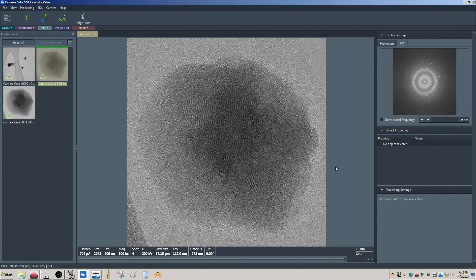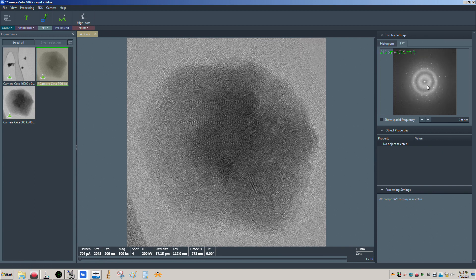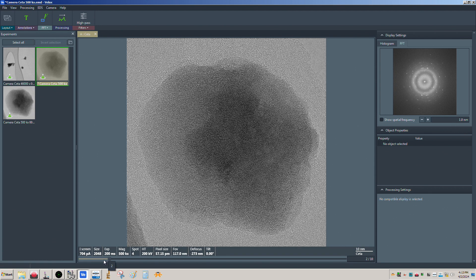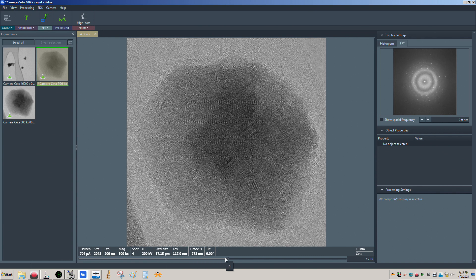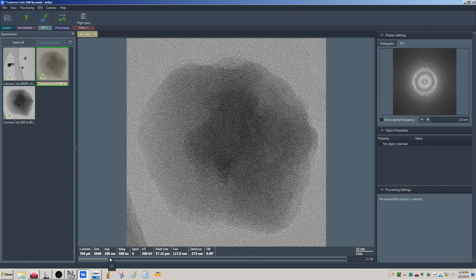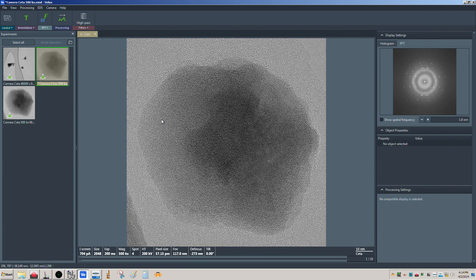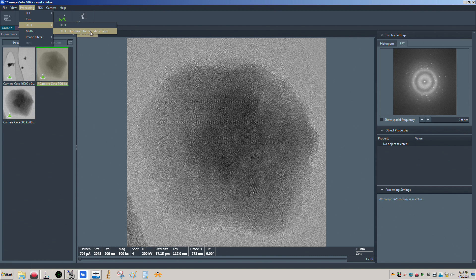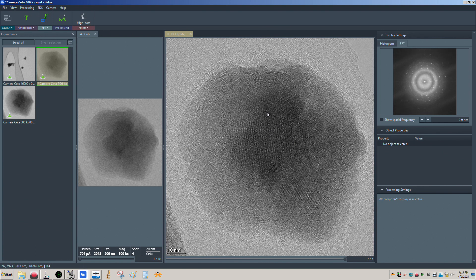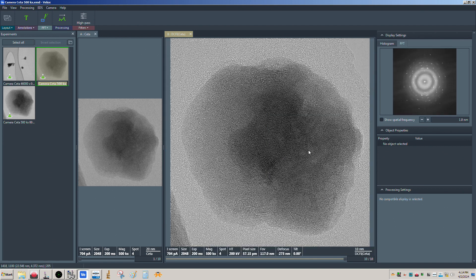Now if we come over to the series — this is just one individual frame — I don't see the same issue. The FFT shows signal in every direction. If I scroll through, you can see the particle slowly drifting up. It's not a lot of movement — probably a nanometer or two — but that's quite a bit when we're talking about atomic resolution. Now if we go to Processing, because we're seeing the lattice we want to use 'Optimize for Periodic Images' and it's going to sum up the frames.